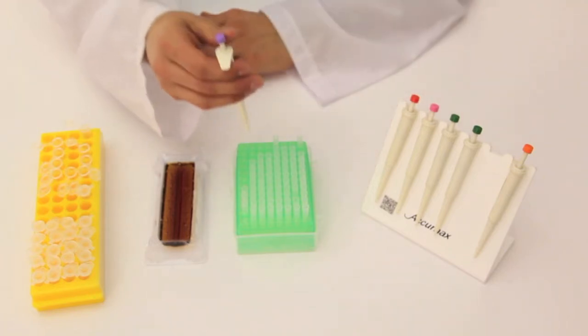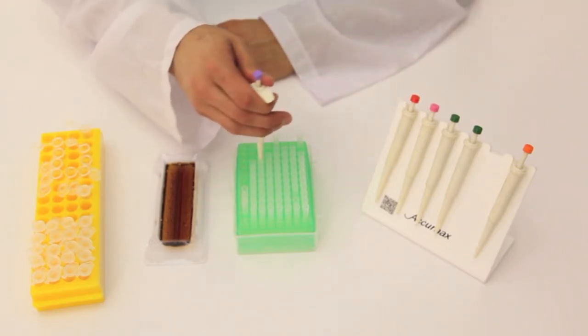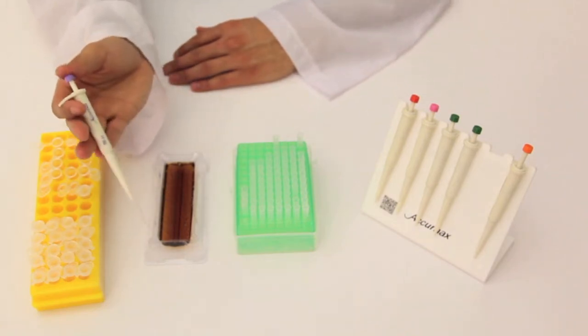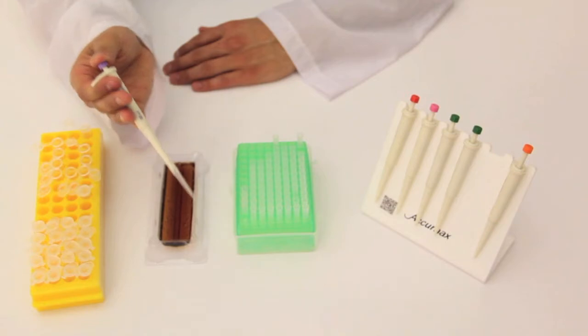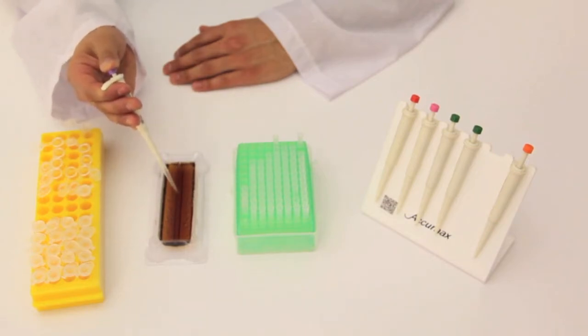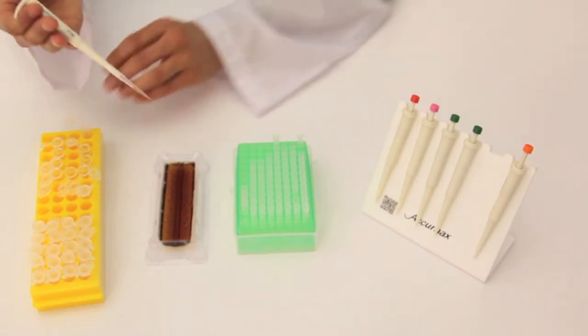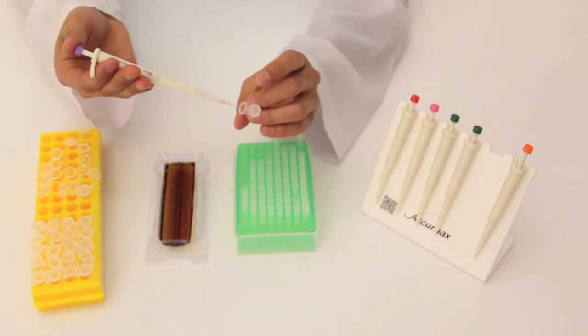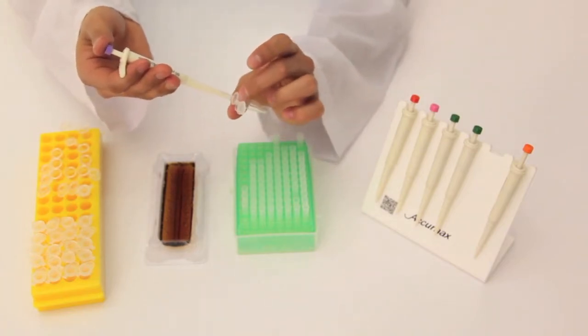To get started, you want to firmly press the pipette into a pipette tip to create a snug closure. Then you want to press the knob to the first stop. Step the tip into the solution, release your knob to draw up the liquid. Transfer the liquid over to a tube by putting the tip all the way to the bottom.